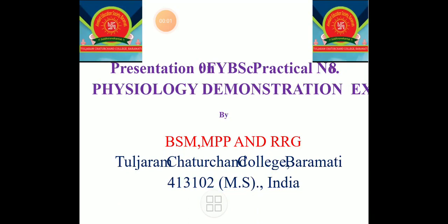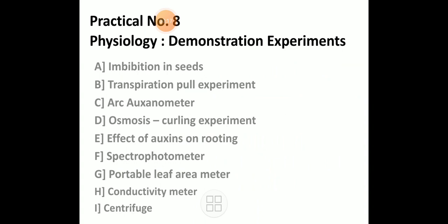Hello friends. Today we are going to get an idea about a very interesting practical, practical number 8, physiology demonstration experiments. Friends, we have to keep in mind that today we will learn about physiological experiments, in the sense of how things happen in nature, which we can prove experimentally here. For that, first we have to get an idea about imbibition in seeds.